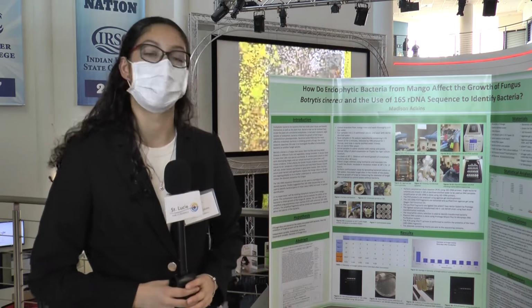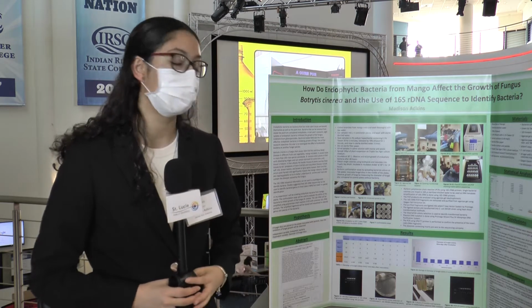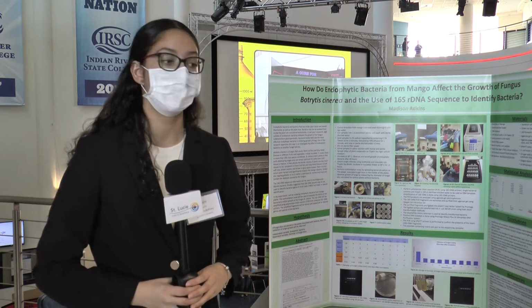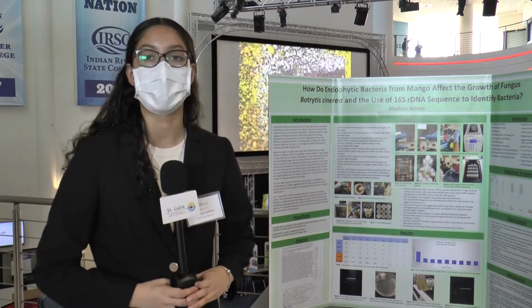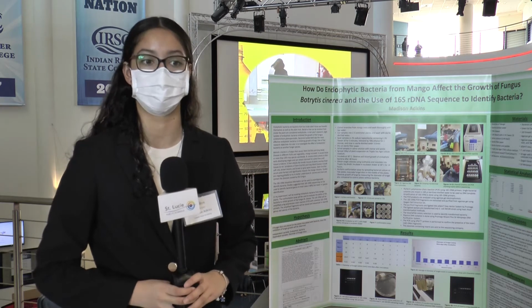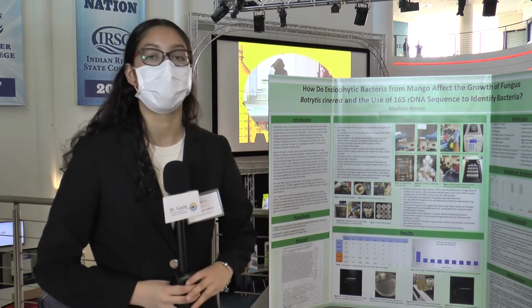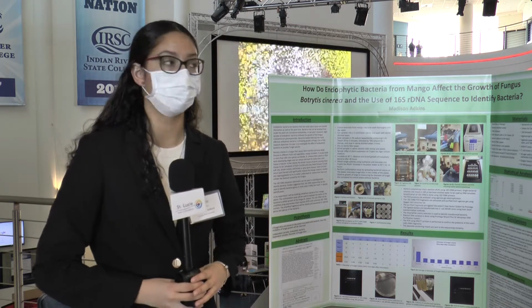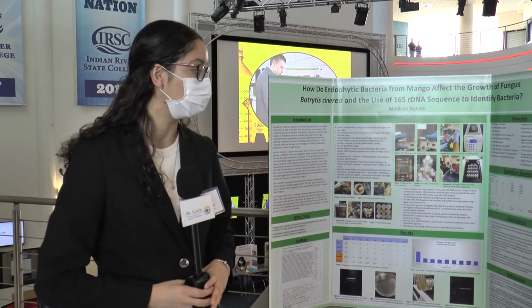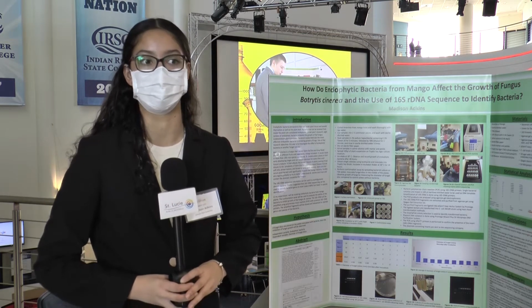And yeah, so in conclusion, all bacterial colonies were observed. My next step right now is to send my data to a company to further sequence and send back the base pairs for my bacteria, and once I get that back, I'll be able to compare it to a database and hopefully be able to identify what this bacteria is. And like I mentioned earlier, the bacteria did have an effect in inhibiting the growth of Botrytis cinerea, and hopefully in the future more studies will be done and I can do more research to see how endophytic bacteria can be used as a biocontrol agent.